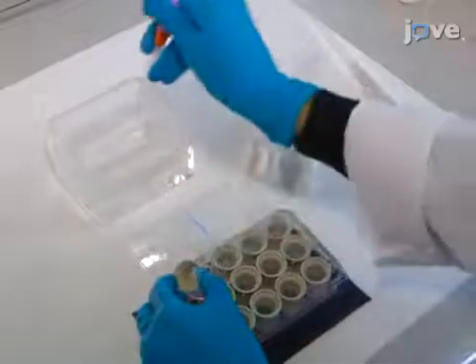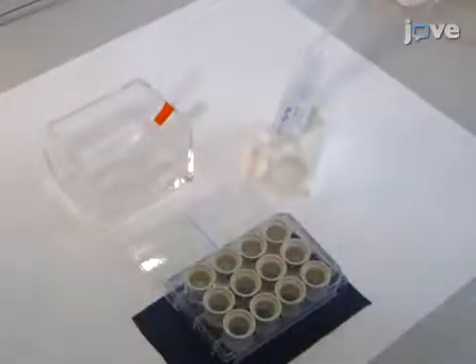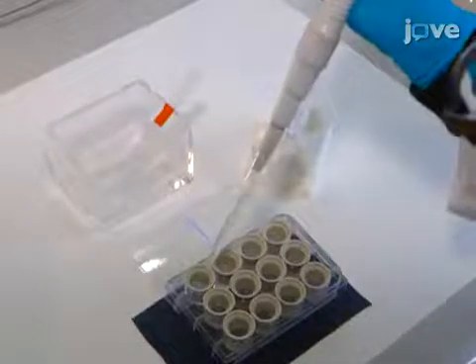Next, suppress the endogenous peroxidase activity by incubating the sections with 3% hydrogen peroxide in 0.1 molar PBS for 30 minutes at room temperature.